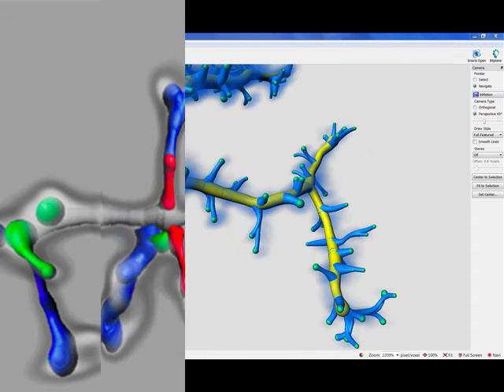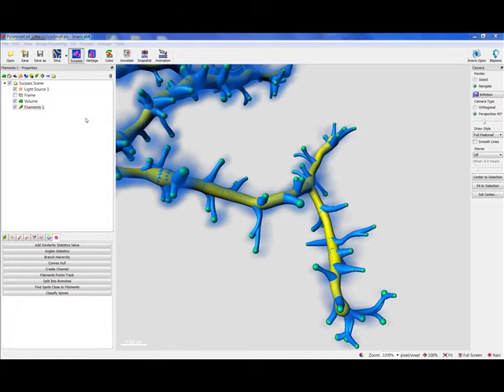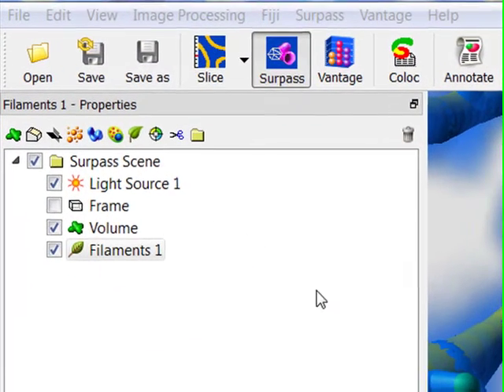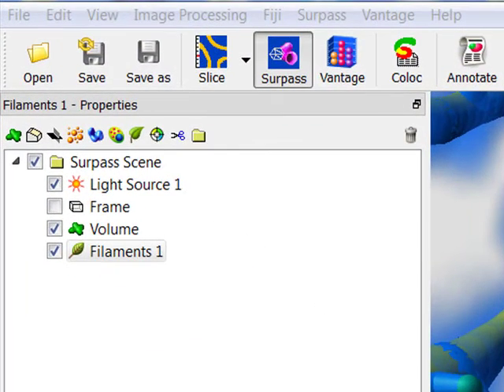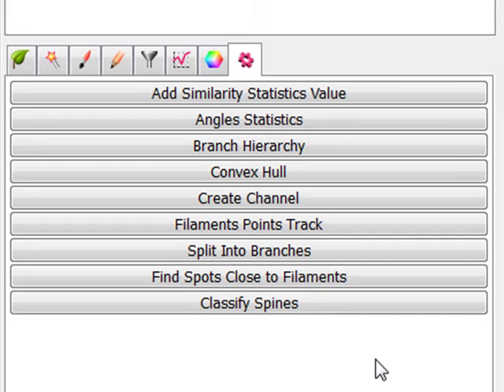We will start this tutorial when the filament tracer wizard is completed and the dendrites and spine objects created. The classify spines extension is available under the tool tab. Click on the classify spines button to start this extension.